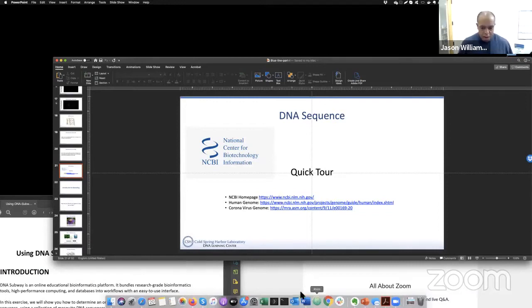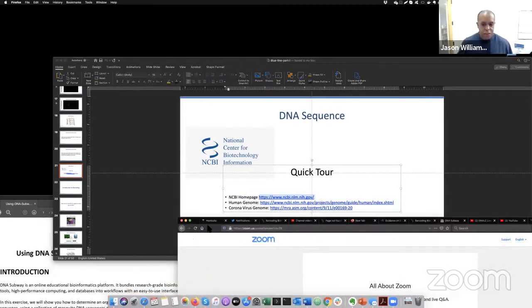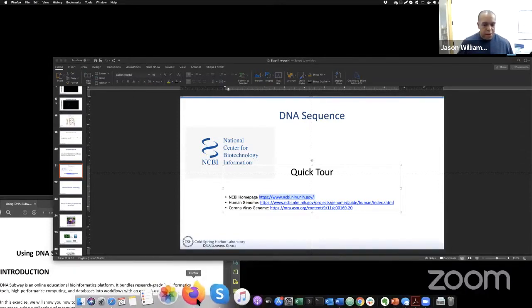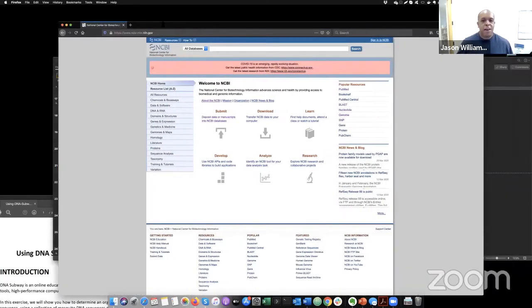So what I'm going to do right now is I'm just going to go ahead and click on or copy one of these links. I thought that they would copy for me, but I'll go ahead and start a new browser. So let's go ahead and open up an entire new clean window there and go to NCBI.